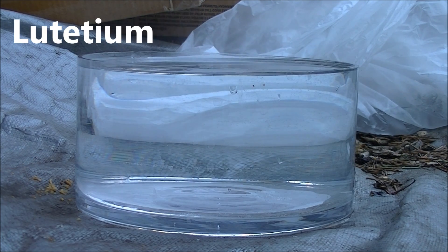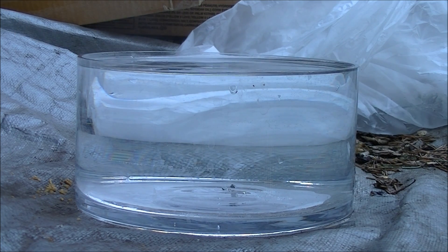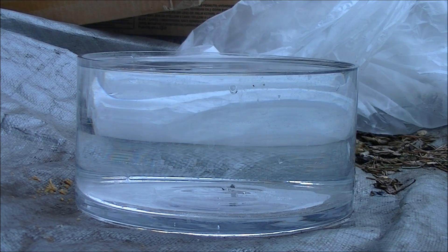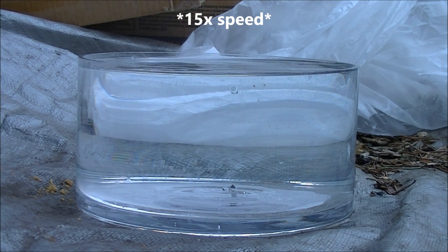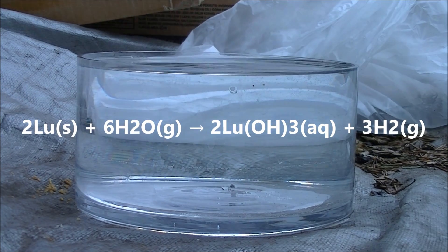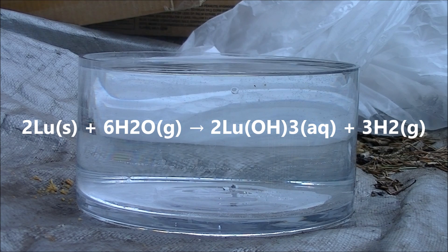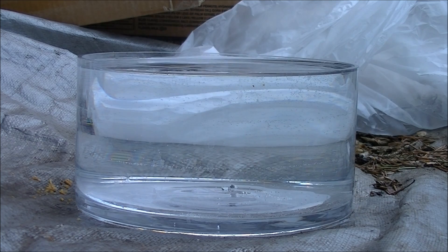And finally, here's lutetium. Unlike the first two, lutetium actually does have an interesting reaction with water. Unfortunately, the sample size I purchased was really small, so you don't really get to appreciate it for how cool it is.